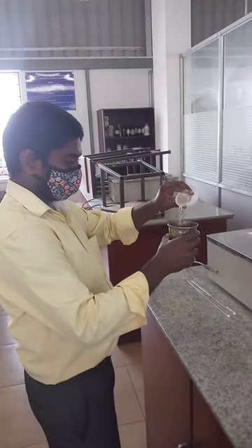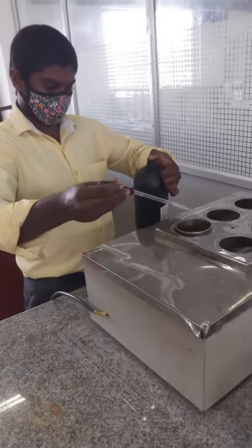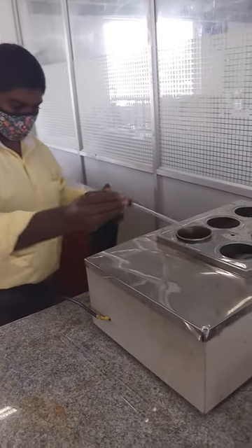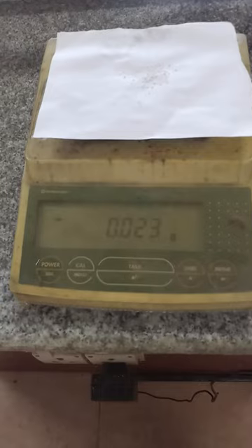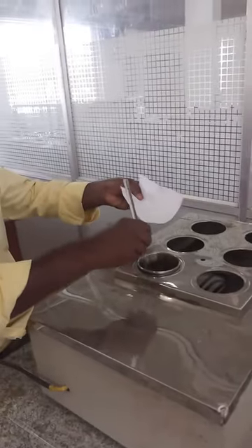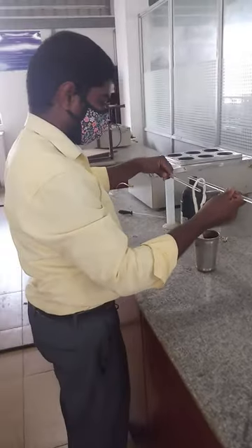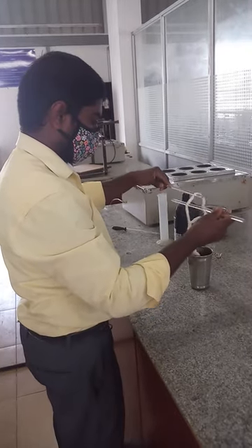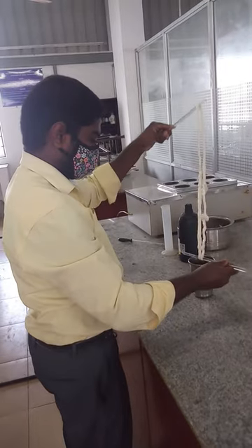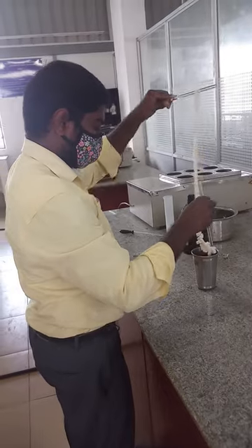96 ml of water has to be taken. 6 ml of sodium hypochlorite has to be added to the bleaching bath. 0.023 grams of sodium carbonate has to be taken and it should be added to the bleaching bath. The sample has to be wetted and immersed in the bleaching bath, and bleaching should be carried out for 90 to 120 minutes at room temperature.